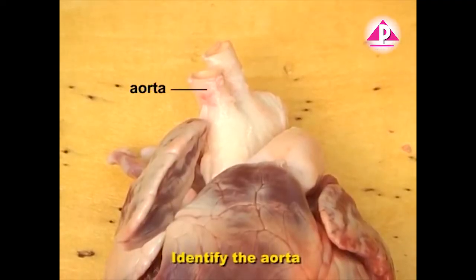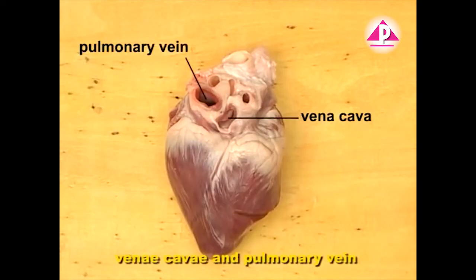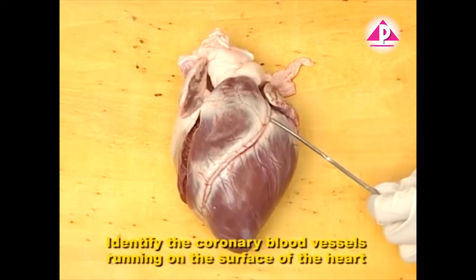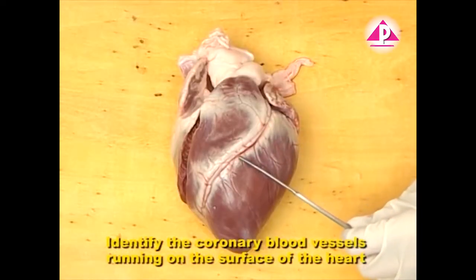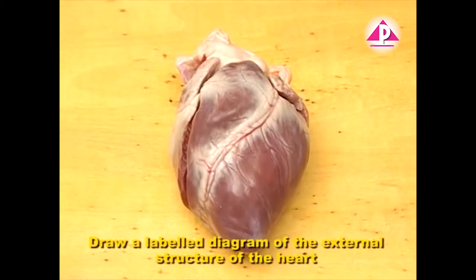Identify the aorta, pulmonary artery, vena cava, and pulmonary vein. Identify the coronary blood vessels running on the surface of the heart. Draw a labeled diagram of the external structure of the heart.